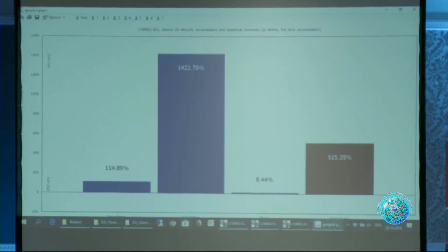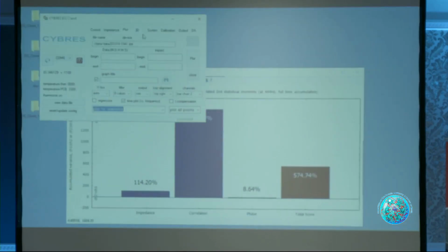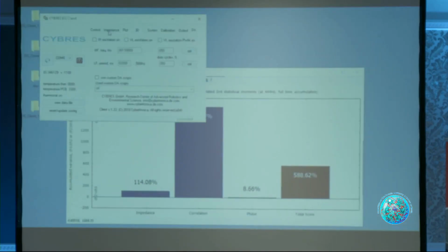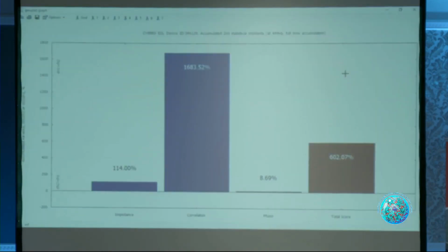So the major point here that we can demonstrate: we switch off excitation, we switch off measurement. The main point, what people mostly ask, is the difference between my chemically equal fluids, because the fluids are chemically equal. Here, of course, we have some issue with temperature, because the temperature is probably not absolutely the same. But temperature, like I said, has an impact, but at least not so huge. There's not really a dramatic impact.